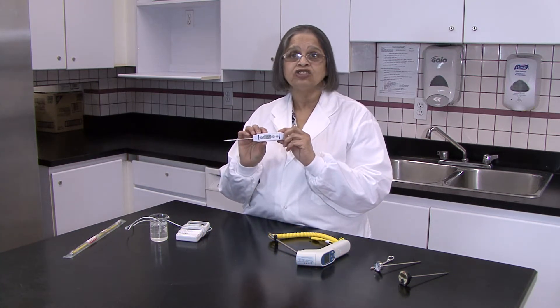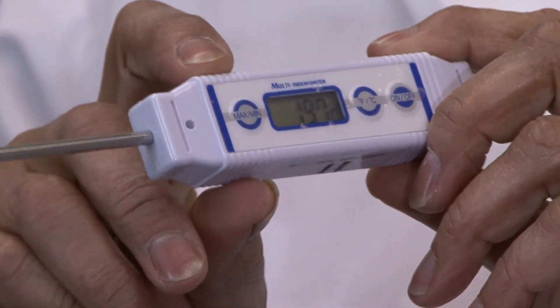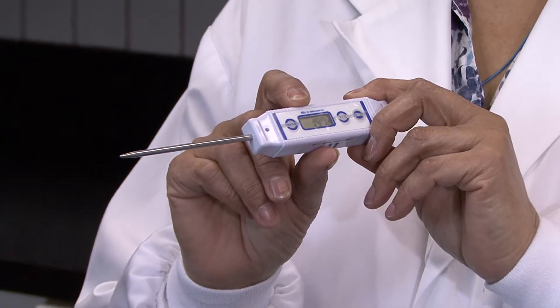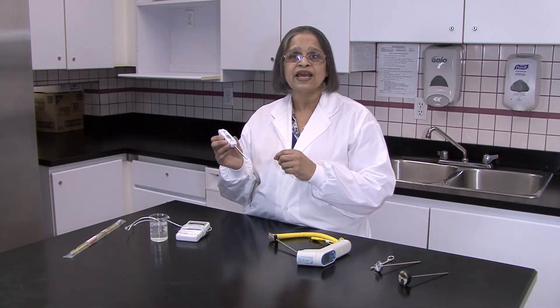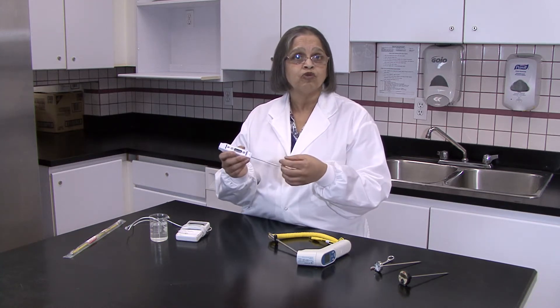This is a probe thermometer. It also has a digital readout, the same as our laser thermometer, which removes some of the human error in reading a dial thermometer. It's much more precise. This is used for taking internal temperatures, so we may use this to take the temperature in a kettle or in a food product.